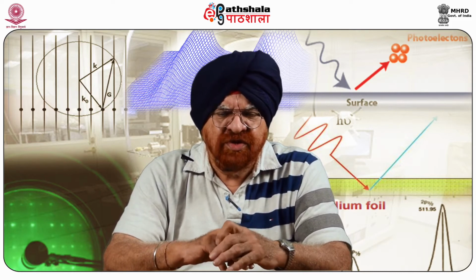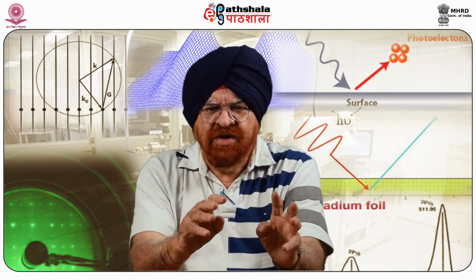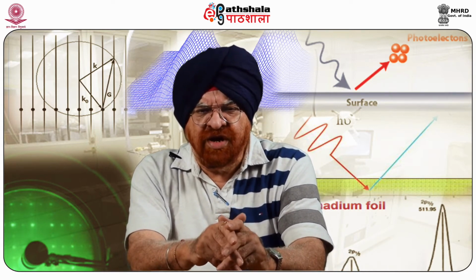Identification of active sites and poisons on catalytic surfaces can be very accurately deciphered with the help of this, which is a great help in carrying out catalytic studies.